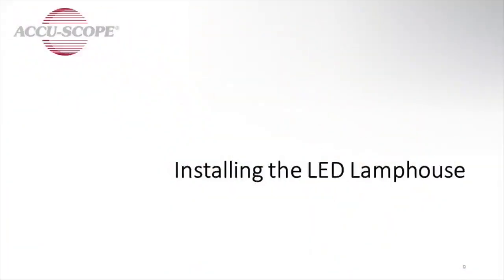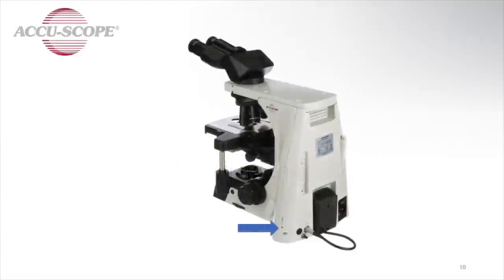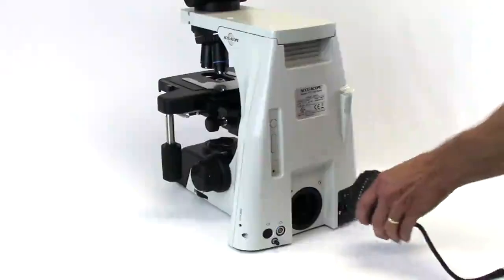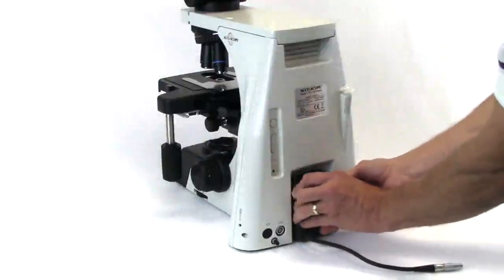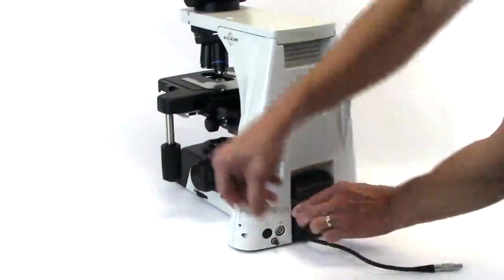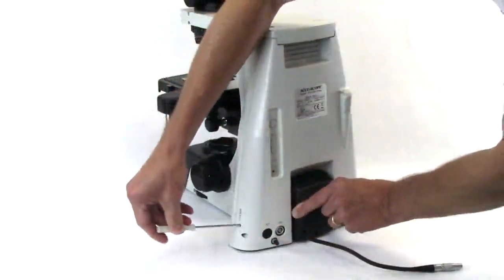Installing the LED lamp house. Using the hex wrench, loosen the LED lamp house lock screw as indicated by the blue arrow. Align and install the lamp house with the opening in the back of the stand. Gentle wiggling of the lamp house may help it insert completely. Retighten the lock screw.